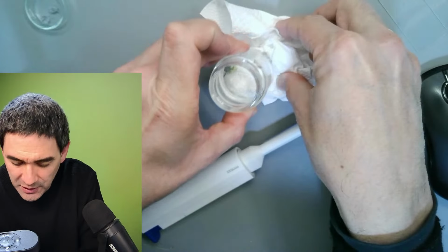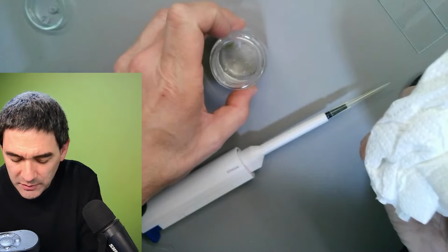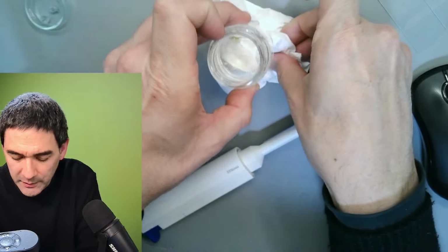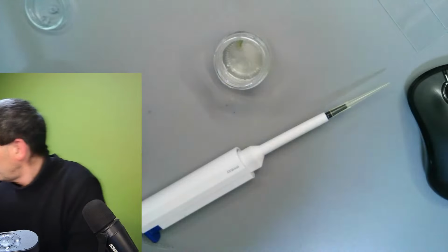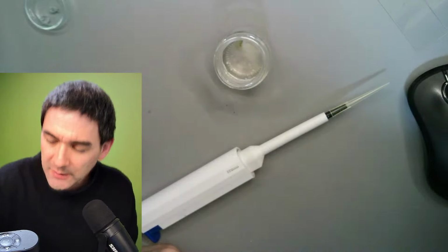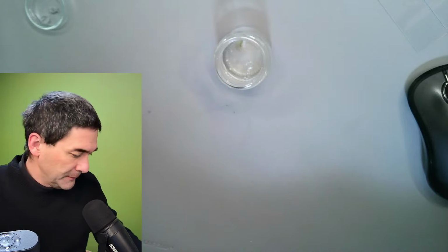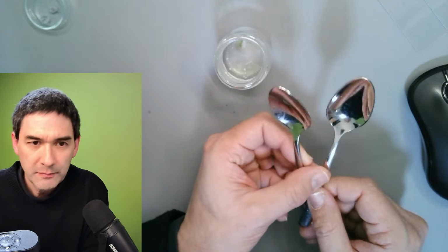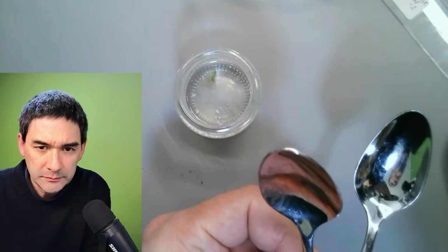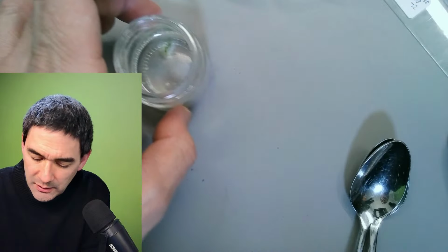You see, because there are bacteria and microbes present and so on, it's not that I'm super scared of them. I mean, these are water microbes. I still want to adhere to basic hygiene. So, and then now here comes the important part. What you need is 2 spoons. We can make it a little bit larger. Okay. And you need this here.